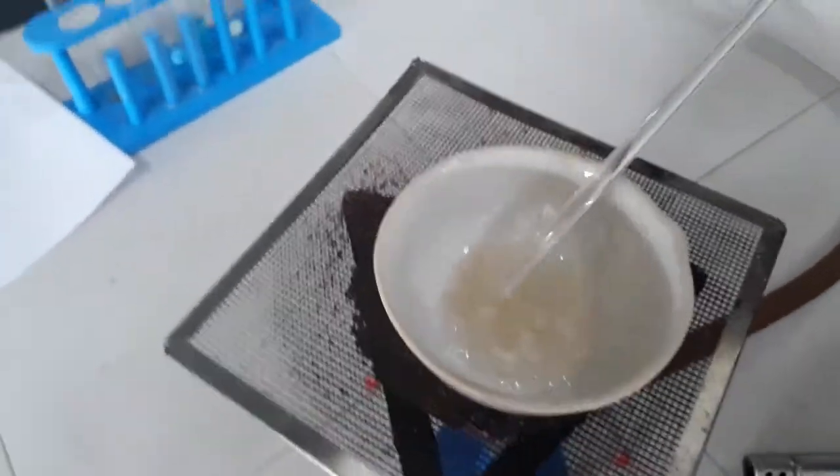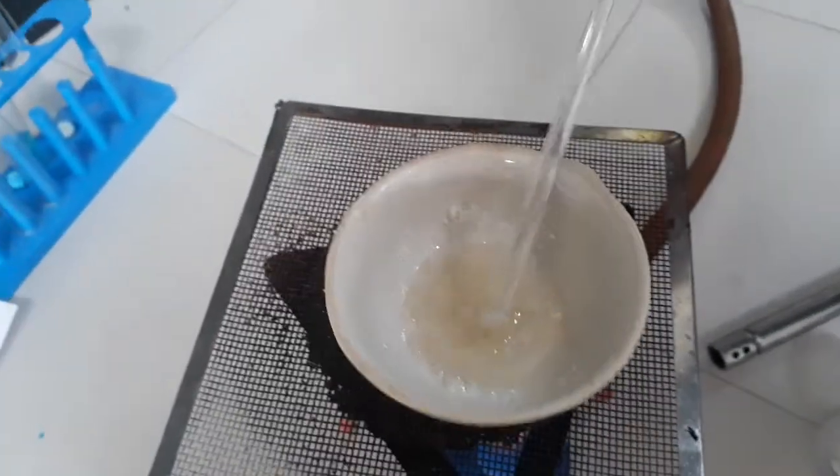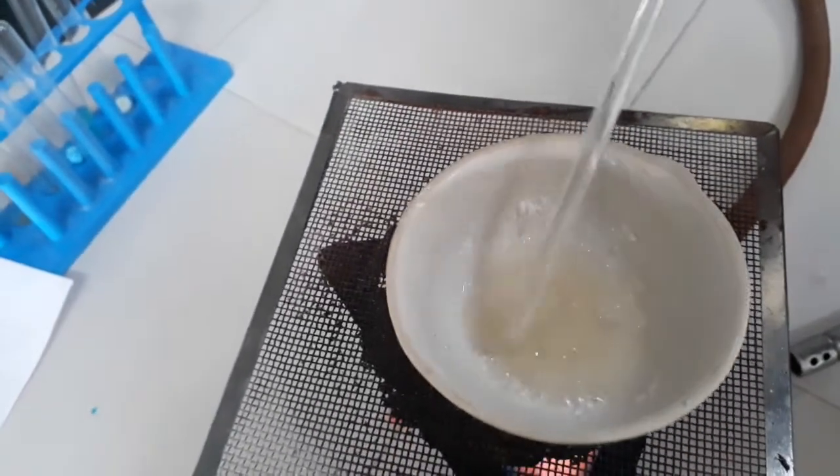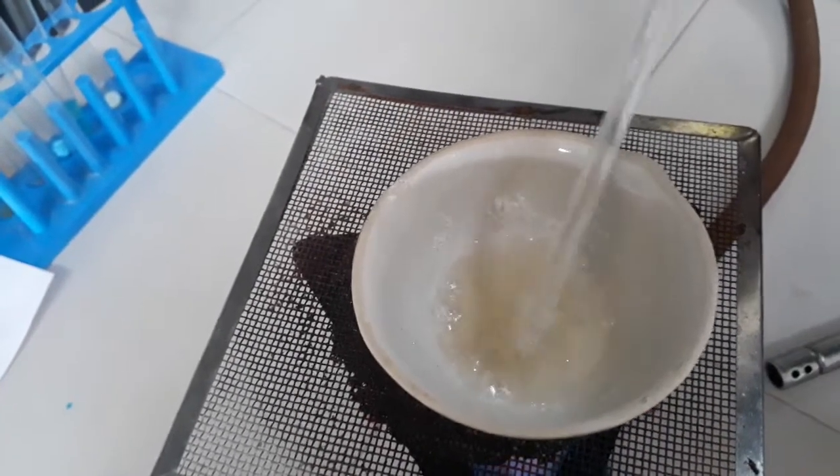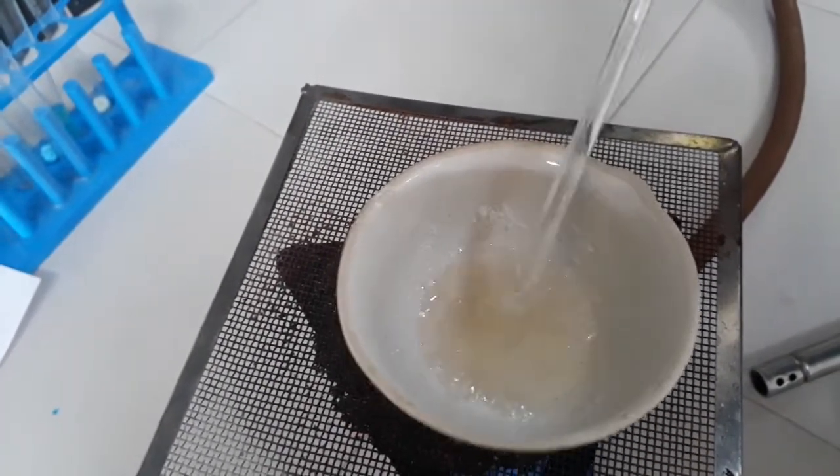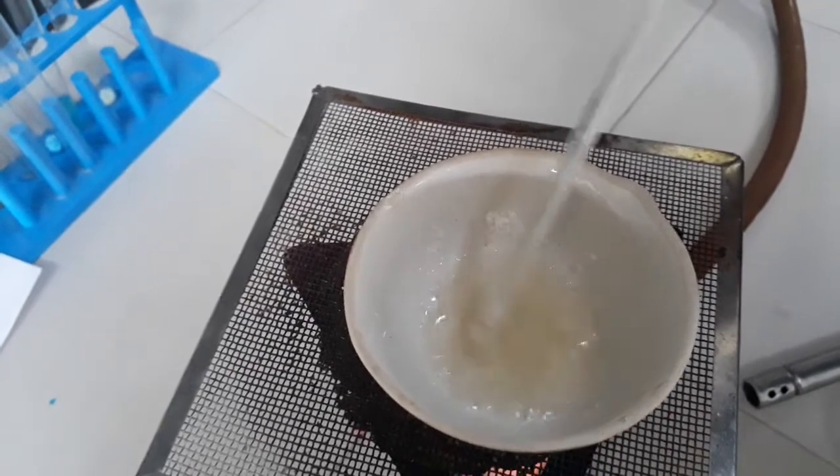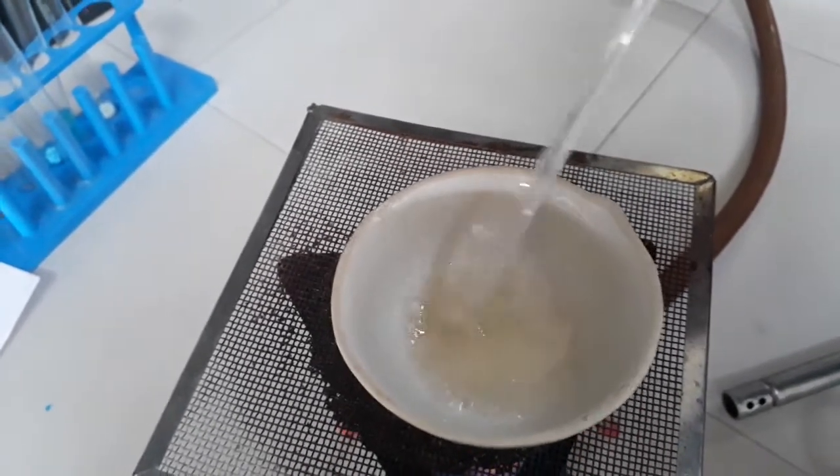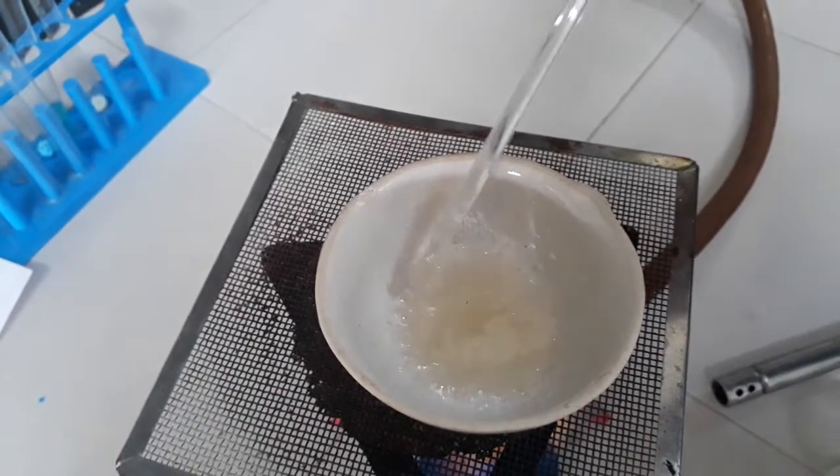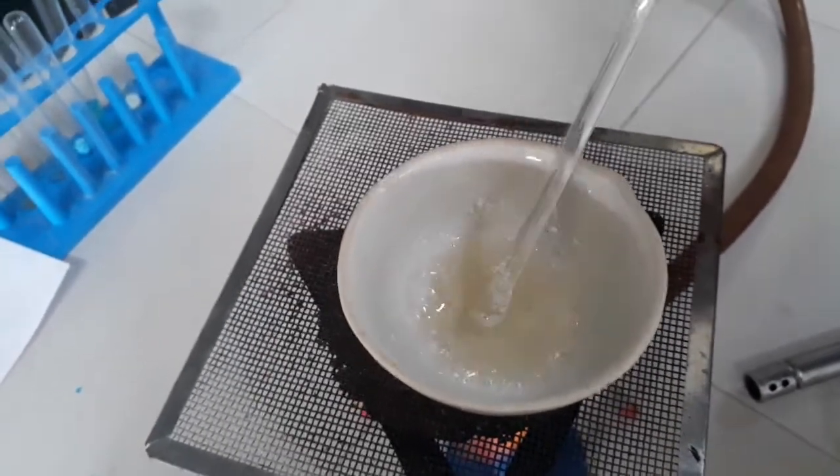After a few minutes you can see the whole alum is converted to liquid state and it is containing a large amount of water. That's why it is looking like this. Compared to copper sulfate and ferrous sulfate, here water molecules are large. In copper sulfate only 5 molecules are there, and in ferrous sulfate also 7 molecules are there.